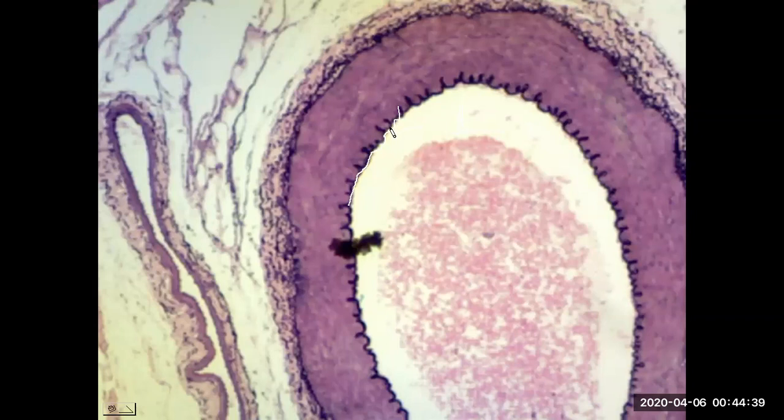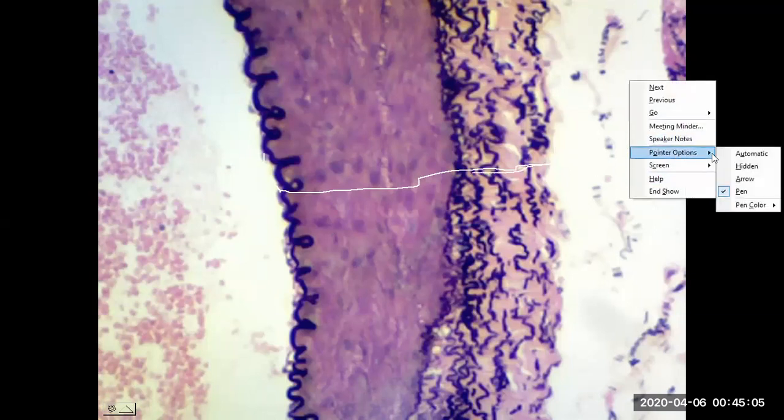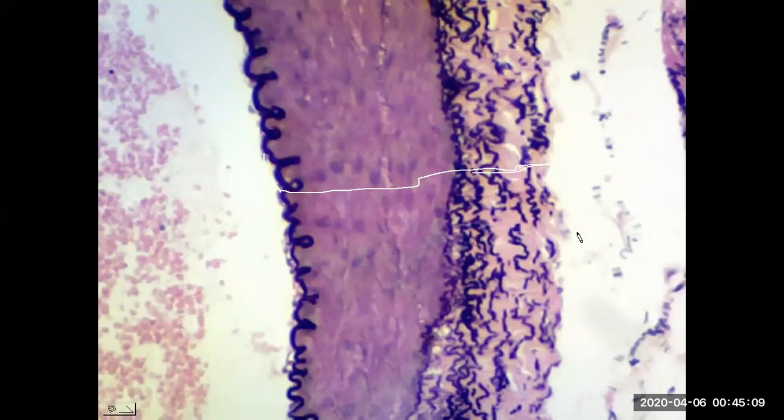So we can see them really well on an artery because it has a thicker tunic wall. But of course, those same three tunic layers, intima, you notice the media is much thinner, and the tunica adventitia. So we see those three layers for artery and a vein, and just a closer look for each. So zoomed in right here, the entire tunic wall for an artery. So again, we can see the details of each tunic layer specifically.